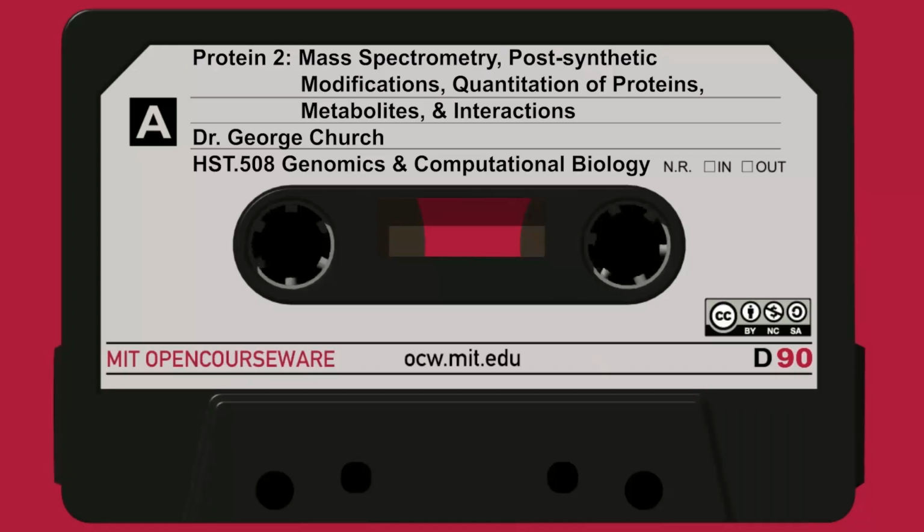And the reason is because what's actually measured is the mass over charge. You're not measuring the mass alone. And so what this is saying is this particular peptide has a +2 charge state. That's an important fact. It's going to be hard to interpret its mass if you don't know its charge, because it's m over z that's measured. The other thing that's measured is from the exact binomial distribution, you can get an estimate of the number of carbons in there. Because if there are a huge number of carbons, then one of the secondary peaks, one of the rightward peaks, will actually be the most abundant one. If it has a small number of carbons, then the 0 carbon 13s peak will be the all-around winner. And so from the relative heights of 0, 1, and 2, you can estimate the number of carbons. So those are the two facts you can get from this sort of high-resolution view of that peak.